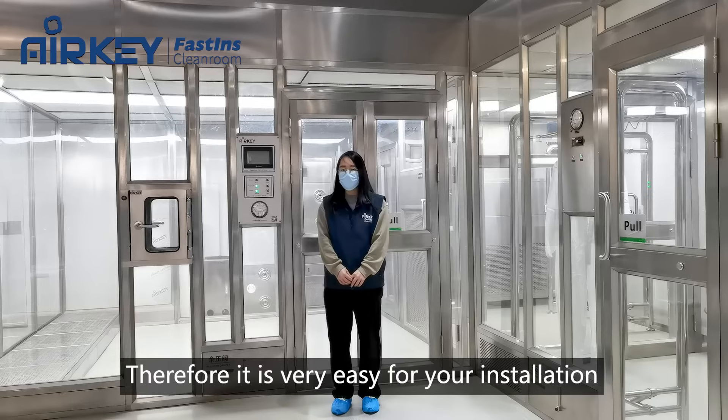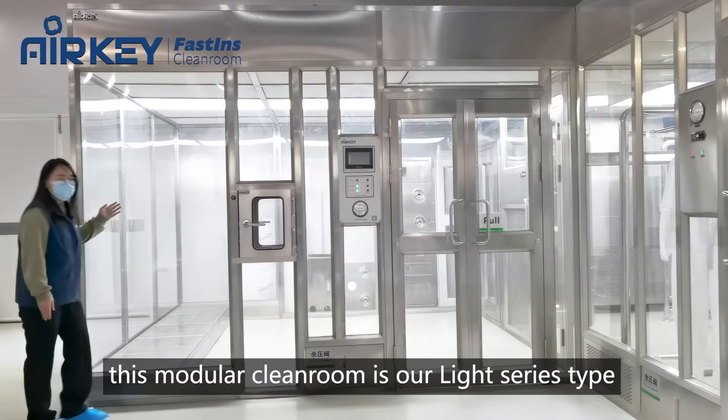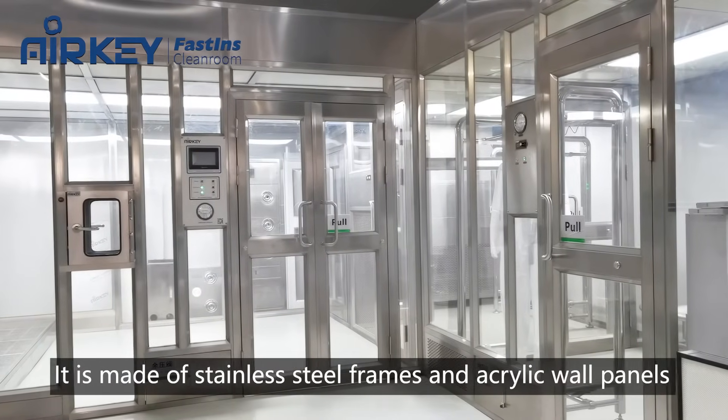Therefore, it is very easy for your installation and can save a lot of construction time and labor costs. As you can see, this modular clean room is our light series type. It is made of stainless steel frames and acrylic wall panels.